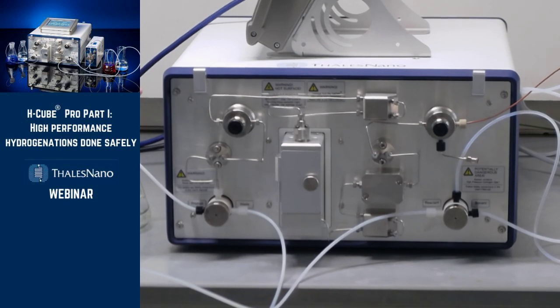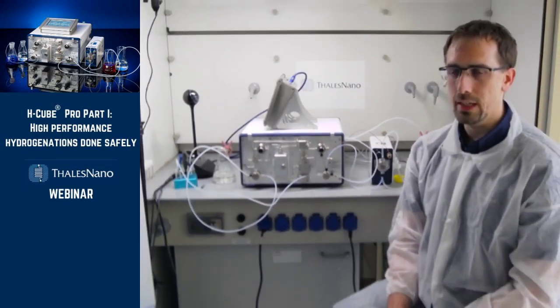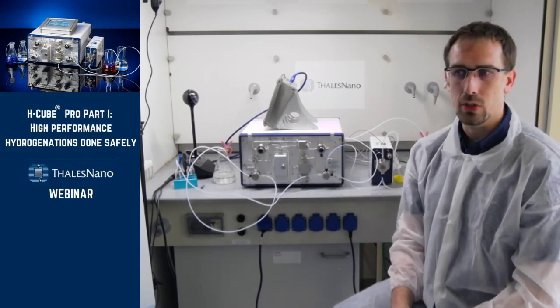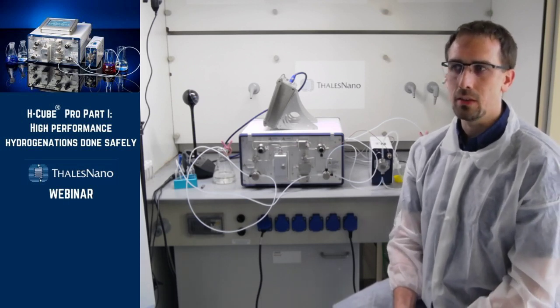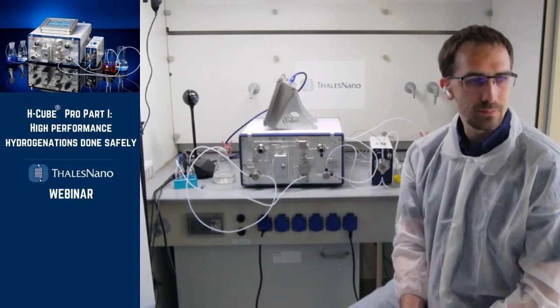The next question is about the Phoenix reactor. Can the Phoenix do all the things that the H-Cube does? Well, the Phoenix doesn't have inbuilt hydrogen generation. So you either need to use an H-Genie, for example, to generate hydrogen, or you need a gas cylinder, or you need the H-Cube Pro to produce hydrogen. Apart from hydrogen generation, in principle, the Phoenix can do all the tasks which the H-Cube does.